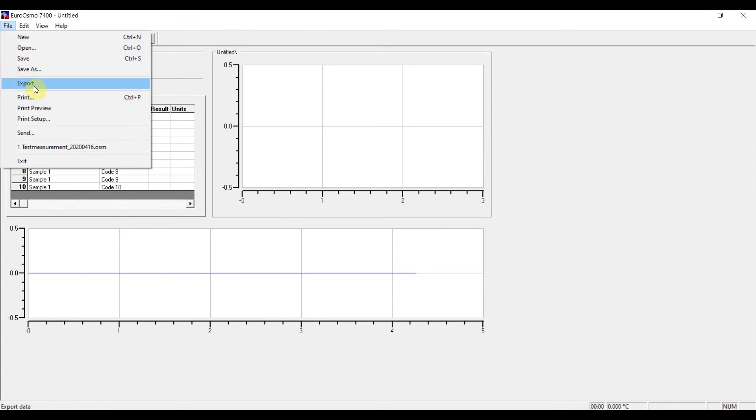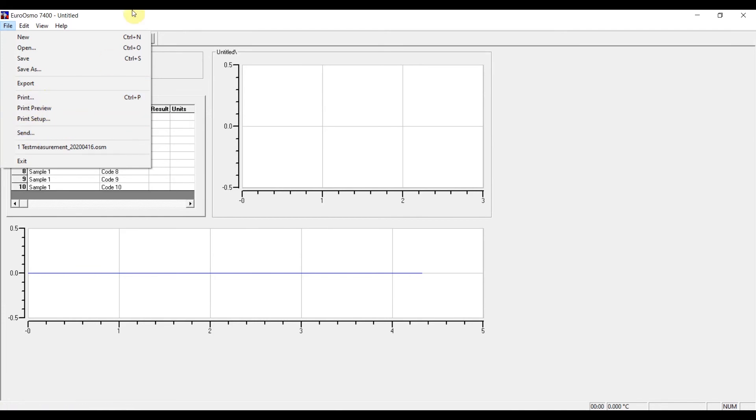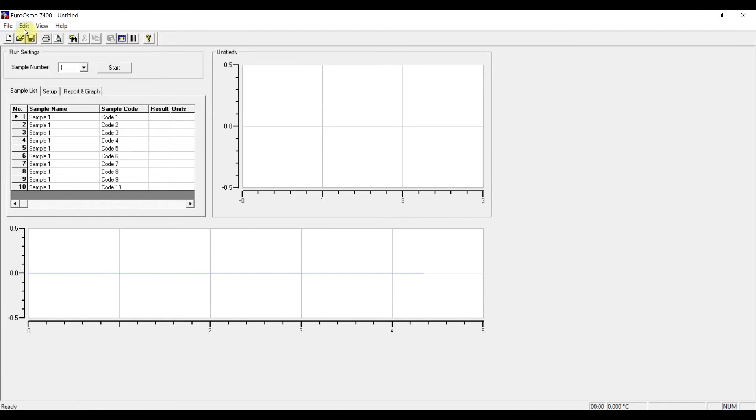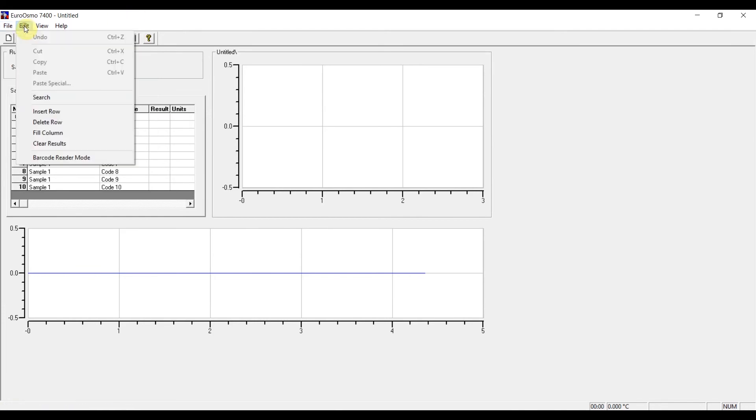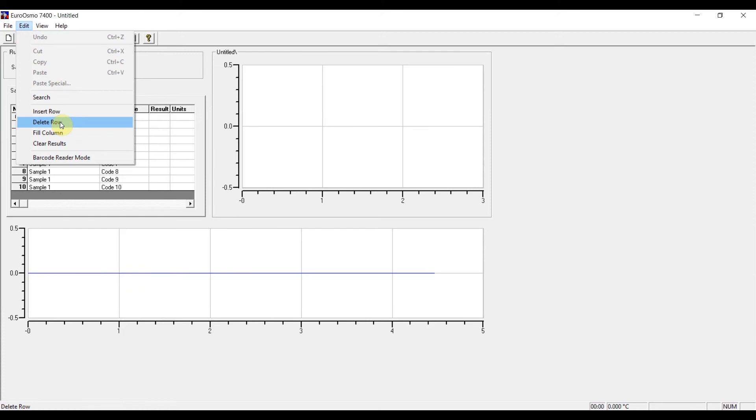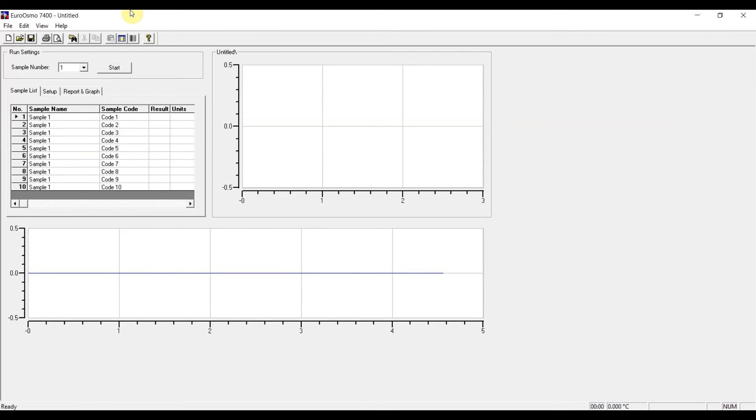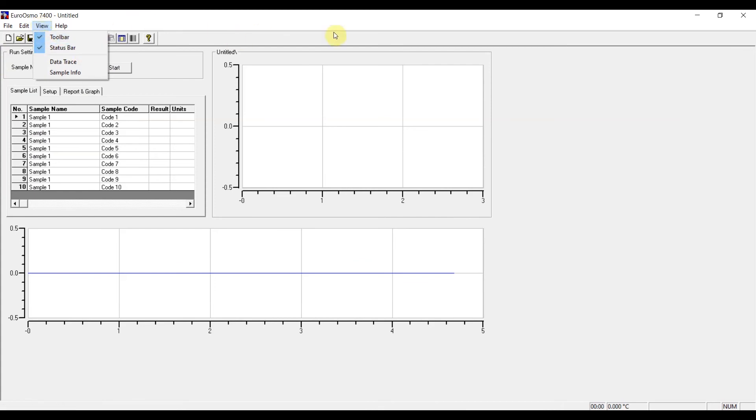In the edit tab you have the possibility to insert or delete rows into the sample list, and you can also fill columns and clear results. And in the view tab you can also customize the user interface a little bit.